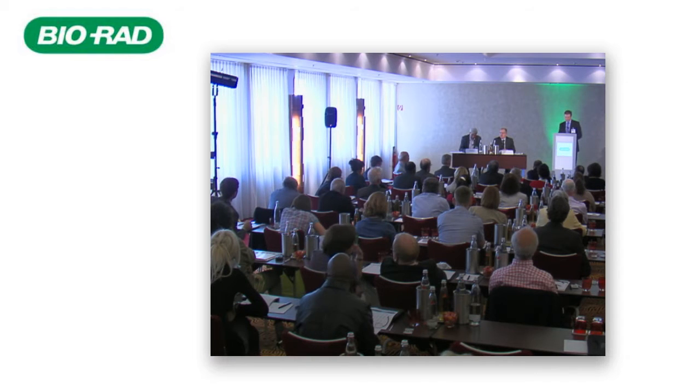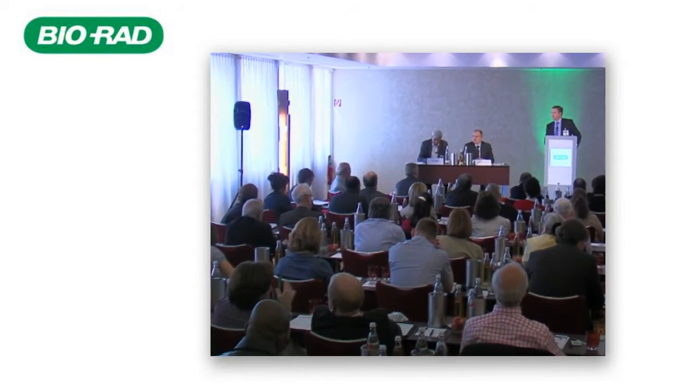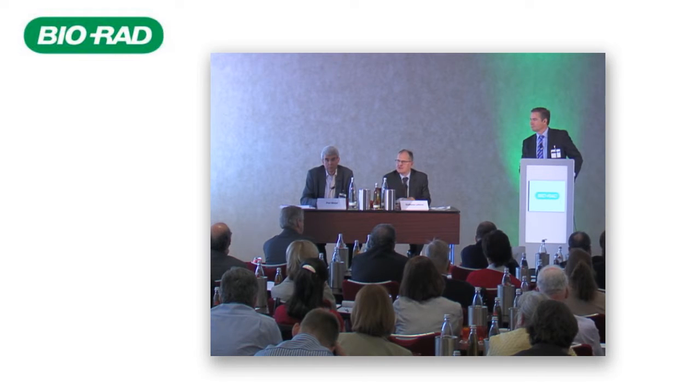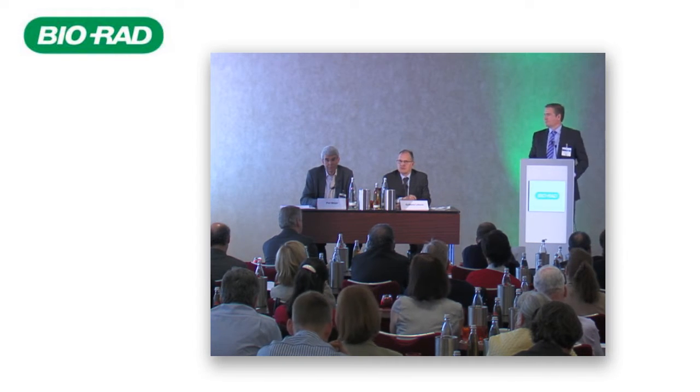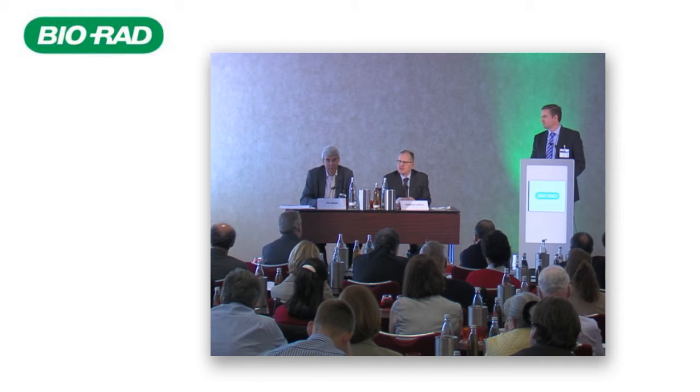No, in my opinion, a quality control sample must be handled by the same person as the plasma samples. So when you receive a vial of quality control, you treat it like a patient sample. You do not have the right to do it differently because, as you say, it would not be the same person, the same experiment, the same experience, the same touch to make the real quality control. It is an external quality assessment, so the same person must handle samples from patients and samples from quality control. In my opinion, it's mandatory. We all know that the vial and the tube are not the same, but the behavior of the sampling, the touch, must be the same.